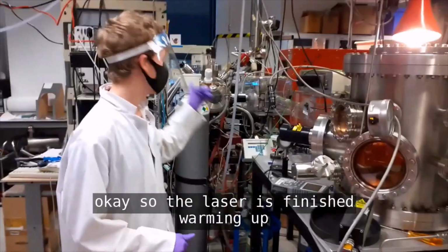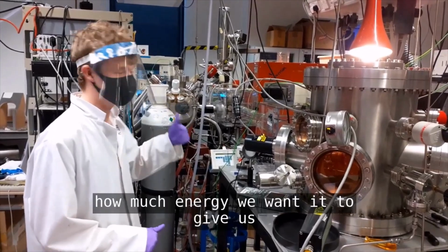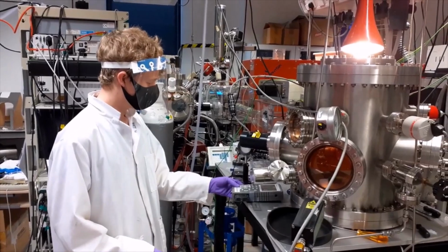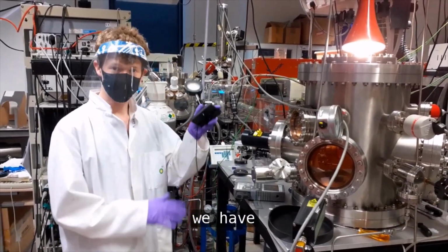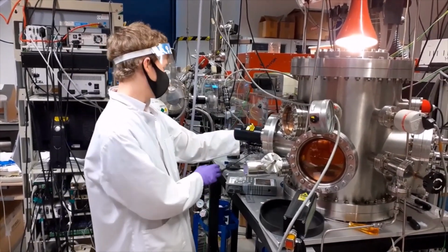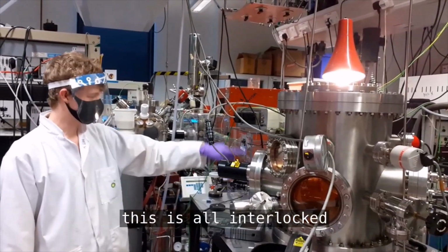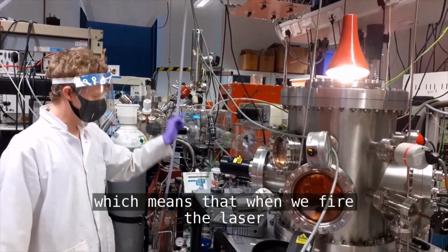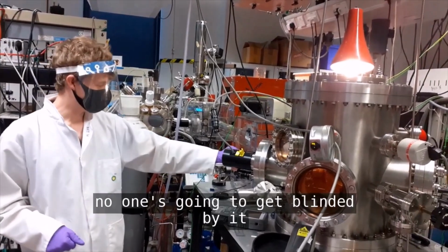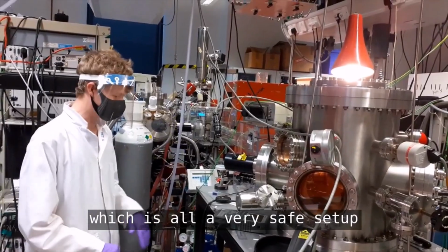Okay, so the laser has finished warming up. Now we need to work out how much energy we want it to give us for this particular growth. We do that with a photo detector here, and we just stick that in the way of the laser beam. This is all interlocked, which means that when we fire the laser, no one's going to get blinded by it, and if anyone opens the door, then the laser will shut off automatically. So it's a really safe setup.